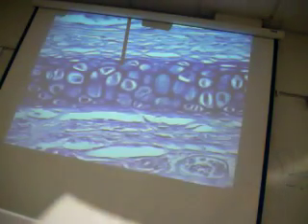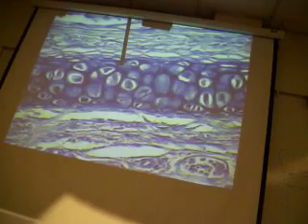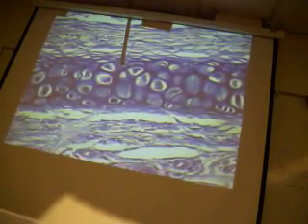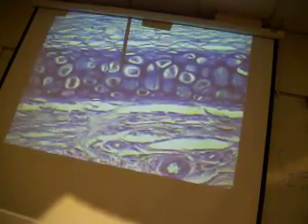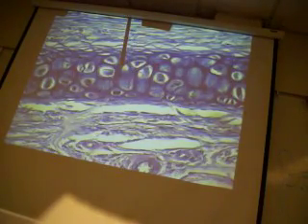Now, you're going to compare this to elastic cartilage. The lacunae and everything else is going to be exactly the same, but notice you see those dark fibers right there. The reason it's so dark is there's a lot of elastic fibers. The elastic fibers and collagen fibers were in the last one too, they just weren't stained for you. This one actually is stained so that you can see these.